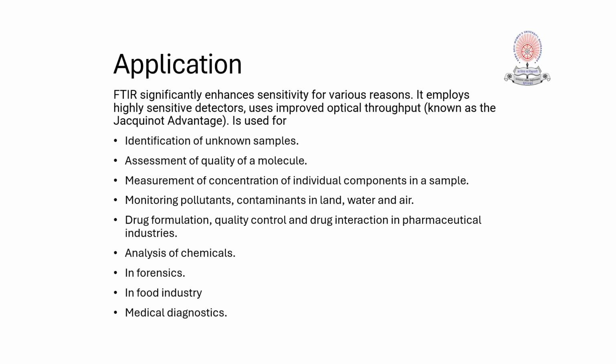FTIR is a highly sensitive technique. It employs sensitive detectors.